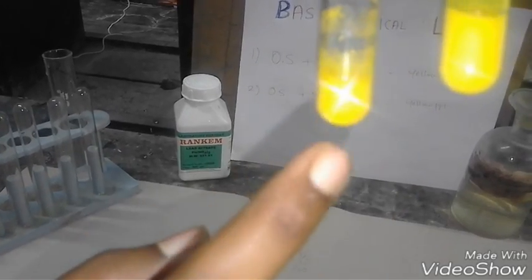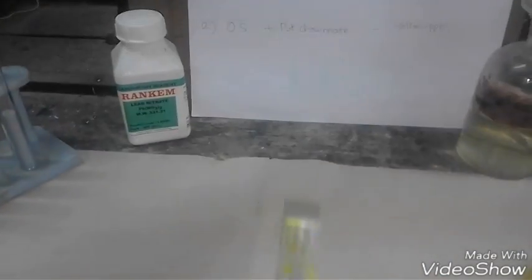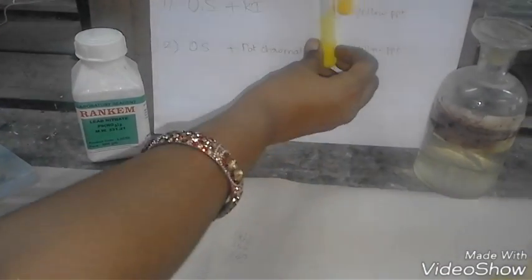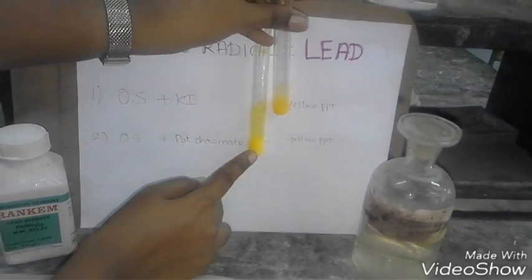These two yellow precipitates indicate the presence of lead, so that the lead is confirmed. The first yellow precipitate is darker than the second.